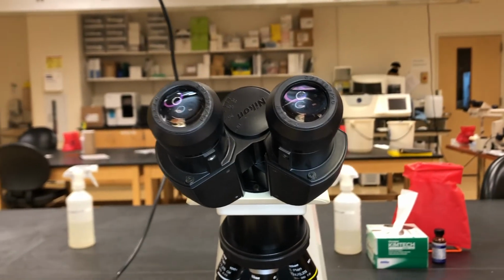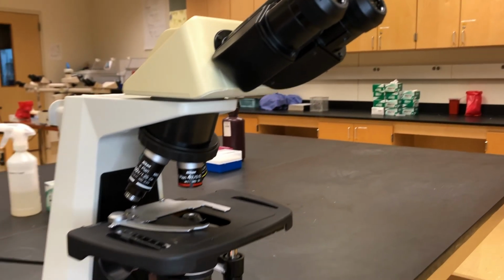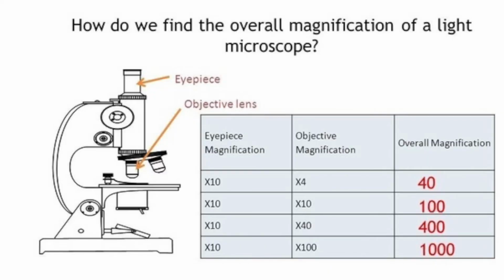At the very top of the microscope we have our eyepieces, or our oculars. Those are typically 10 times magnification. When you add those in with your objective lenses, that's often referred to as a compound microscope because of the two sets of lenses. And because we have two sets of lenses, we can't rely on what's written on our objective lens to be our total magnification. We have to remember that our eyepiece times our objective lens is our total magnification. Example would be we're doing a diff on 100x. We times that by 10 on our oculars, and now we actually have a total magnification of 1000.